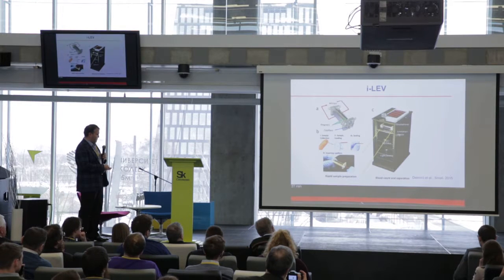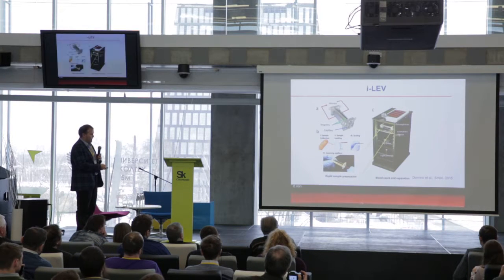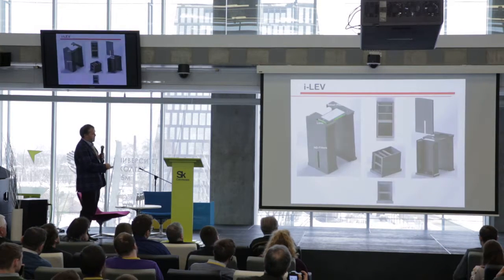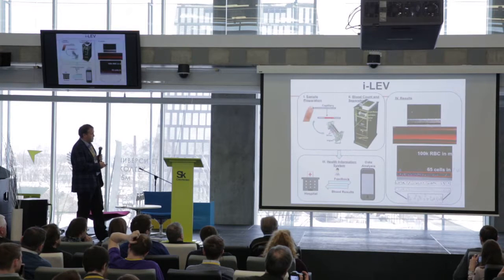Oops, that played really fast. Let me go one slide back. Go up. This is when you loaded the capillary. This is the cell phone image at 25 to 27 minutes. You see the blood come to where it belongs. You can build this system out of plastic pretty easily by designing the different parts and pulling them together, so it becomes a portable system.